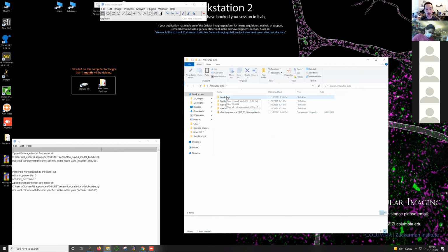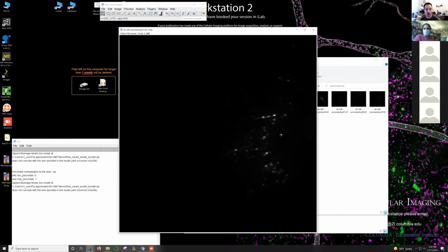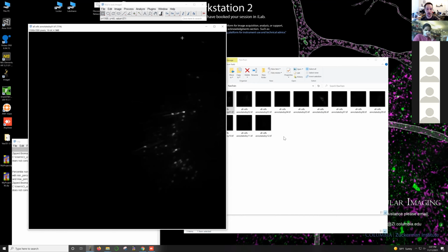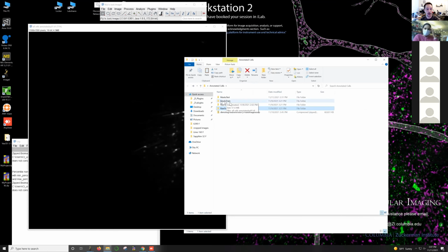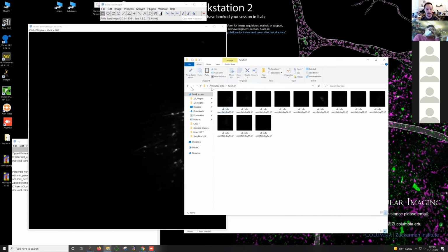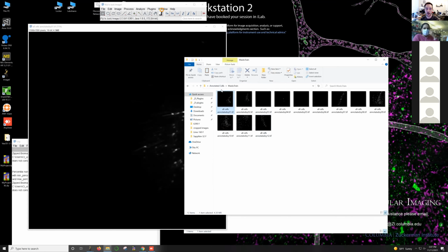In our case, I can show you these data sets, which are very similar to what we worked on. We have our neurons and we've got a lot of projections. It's very difficult to get good results just using classical tools. And then we've got some masks. For this data set, I've got files from 1 to 12, and for exactly those data sets in this masks folder, I have annotated masks.